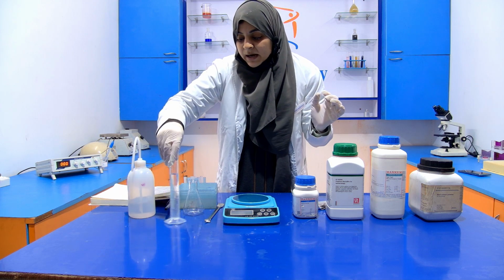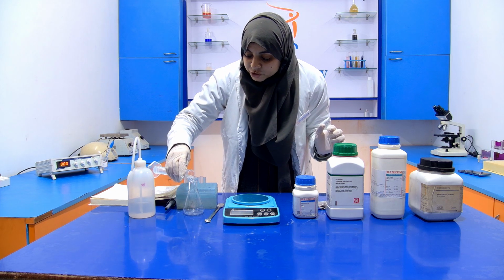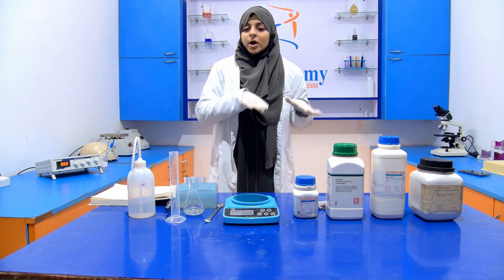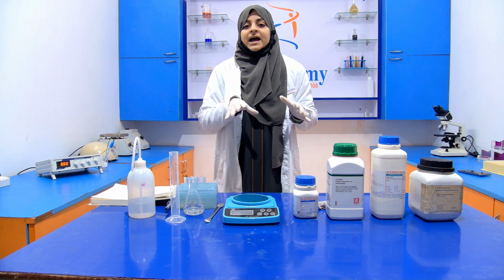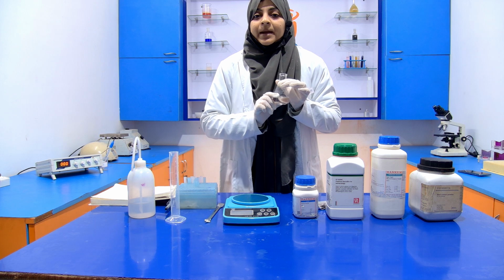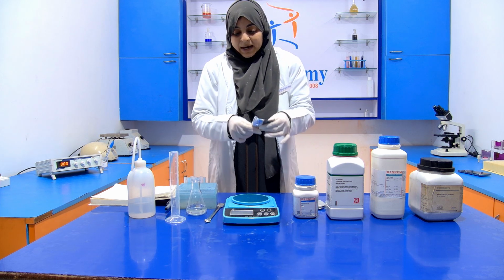Now this is around 50 ml of distilled water, which is used for the dissolution of all the ingredients. Then after that, I am going to add all the chemicals one by one into this conical flask. When all these chemicals are completely dissolved in this distilled water, then the remaining 50 ml water will be added.